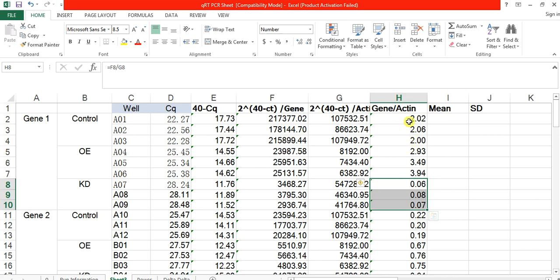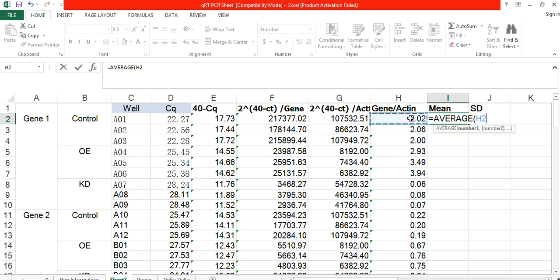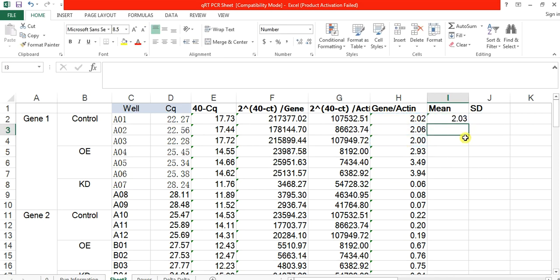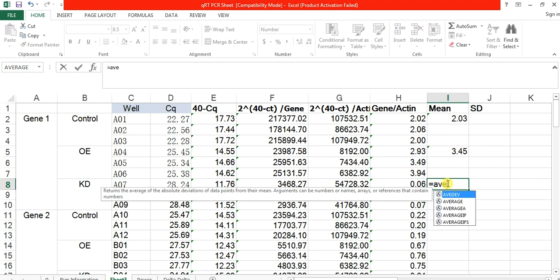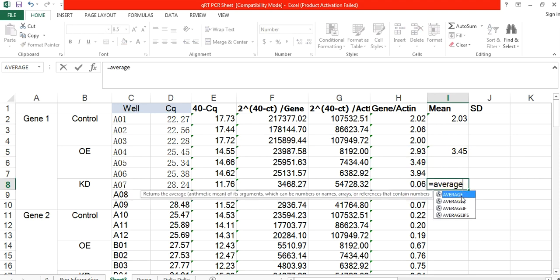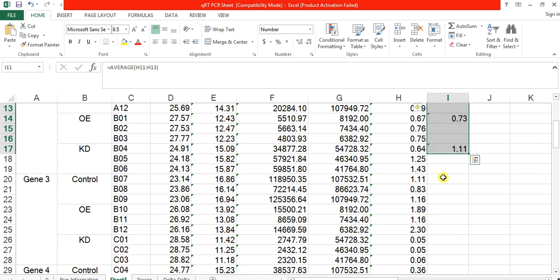But now we need to make their average or mean. So it's equal to average of these three samples. Now here also is equal to average of these three, is equal to average of these three samples. Also copy and paste it in front of this one. First, second way. So automatically the formula takes that value and converts these.